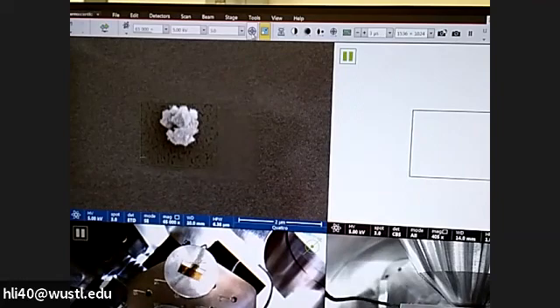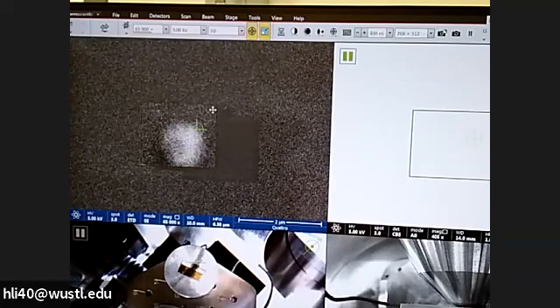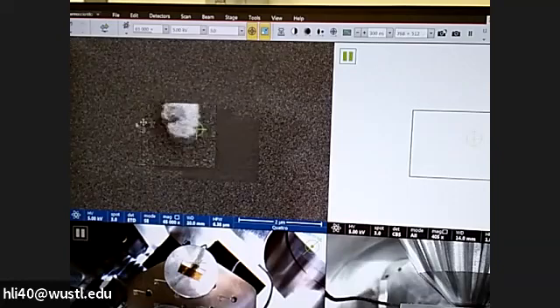Okay, so let me try to see how far it is, because I haven't used this microscope and adjusted it for a long time, so I don't know how it's performing. Let's see how far it goes this time. So simply click this button. You will see, oh, that's a lot. You will see the image or the particles jumping up and down, sometimes left and right, sometimes diagonal.